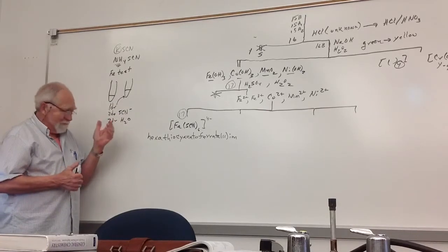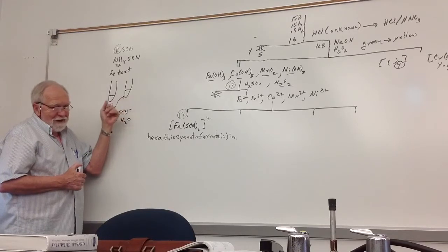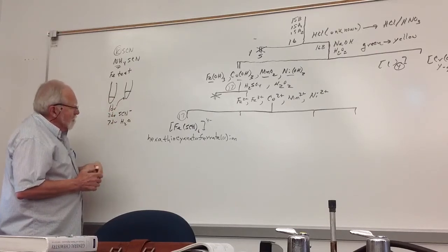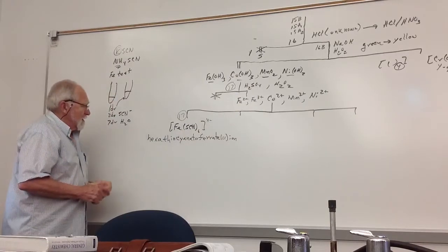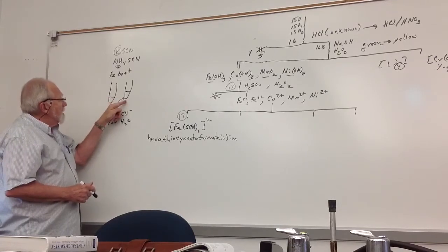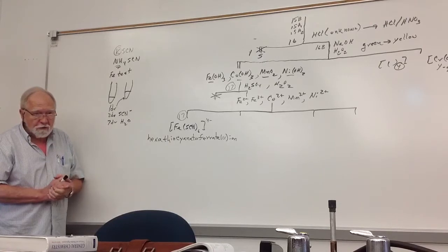Then I always say, well, half the time I say, this should be a little bit darker because most people don't get it dark enough. I don't know why. Possibly because they lost some of their iron coming through. So I comment about that. So I want to see both those test tubes. And you're doing the original solution and a 10-fold dilution. Those are the 2 tubes you show me for iron.